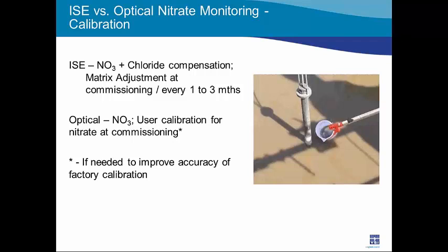Or if you have a single wavelength probe, you would, of course, also have to do a user calibration for that no matter what. But longer term, you probably may not need to repeat that calibration, or at the very least, you'll repeat it very infrequently.